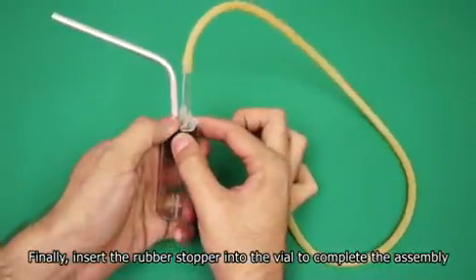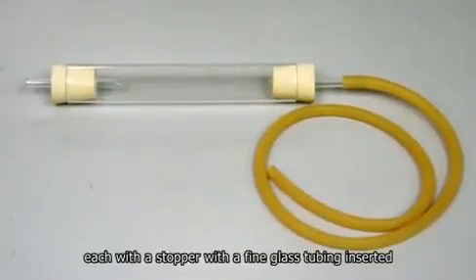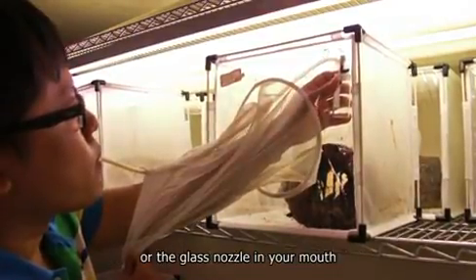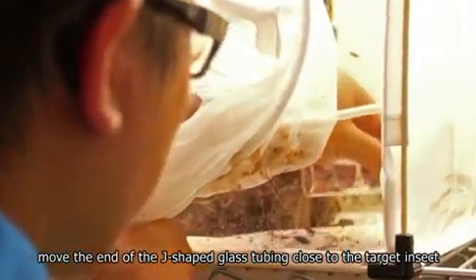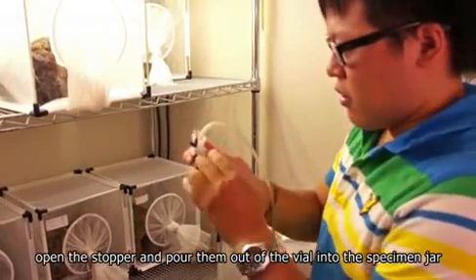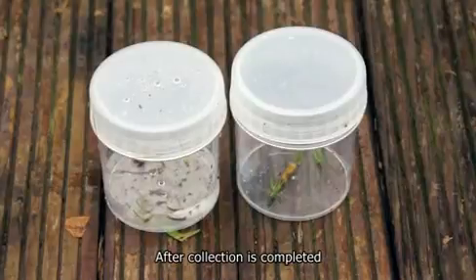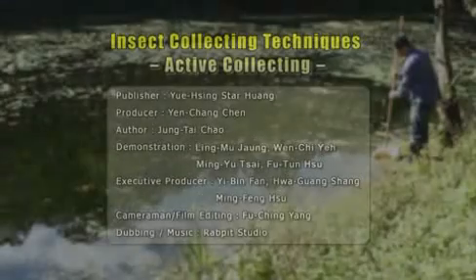Finally, insert the rubber stopper into the vial to complete the assembly. Another type of aspirator has two openings, each with a stopper with a fine glass tubing inserted. When collecting, place the free end of the flexible rubber tube or the glass nozzle in your mouth. Move the end of the J-shaped glass tubing close to the target insect and inhale sharply to pull the insect into the vial. After collecting a certain number of specimens, open the stopper and pour them out of the vial into the specimen jar. After collection is completed, bring the specimens back to the laboratory for further preparation as soon as possible.